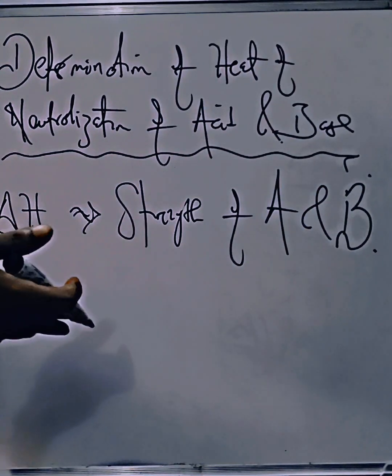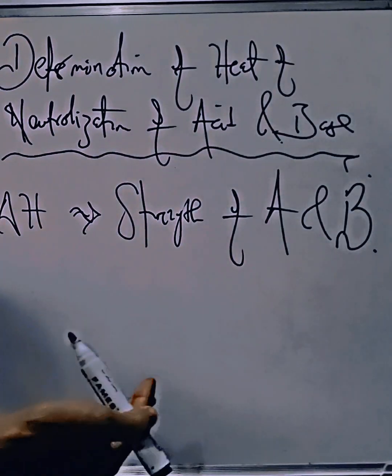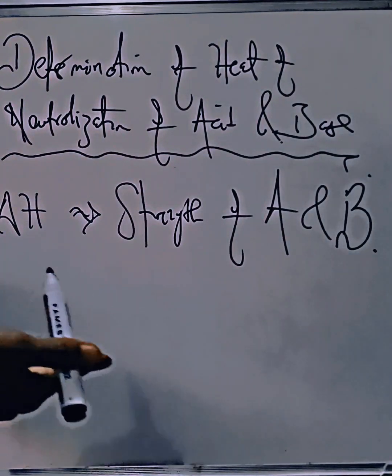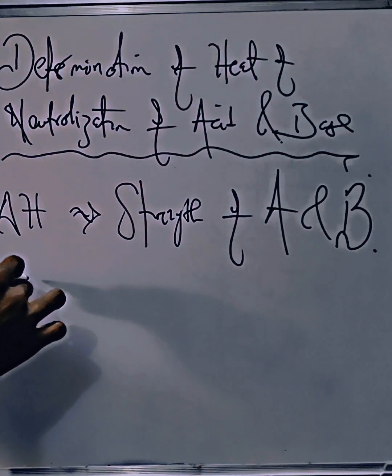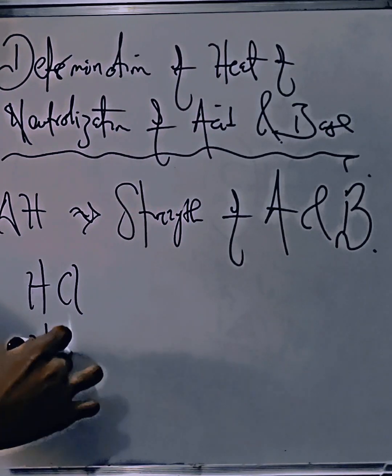We would not be going into that, but to show you some enthalpy changes associated with certain acids and bases for you to see how the strength varies. In this case, the acid you'll be provided is hydrochloric acid, which is a very strong acid, and a very strong base.